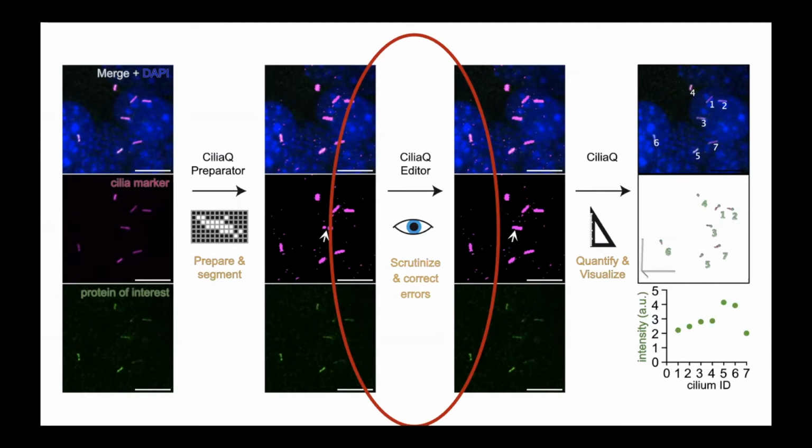You should note that it is best to make as few edits as possible so as not to bias your dataset too much. So only make these corrections that you really feel are necessary. Additionally, you should keep your editing approach consistent.